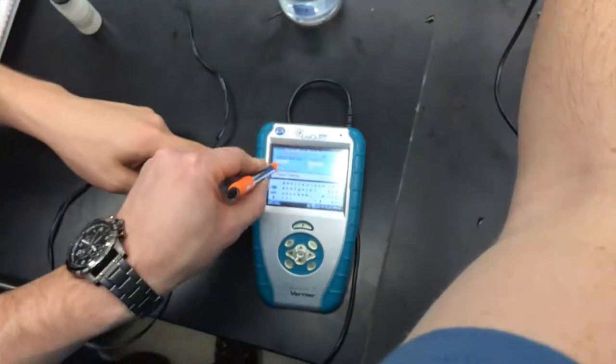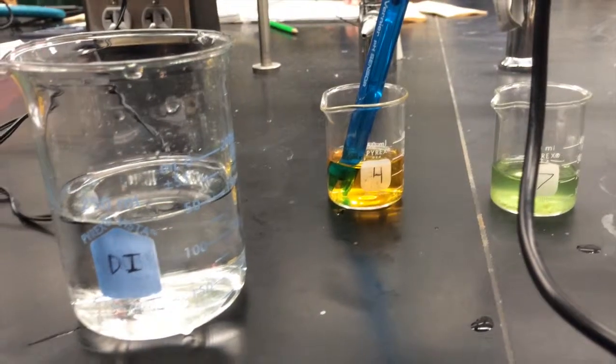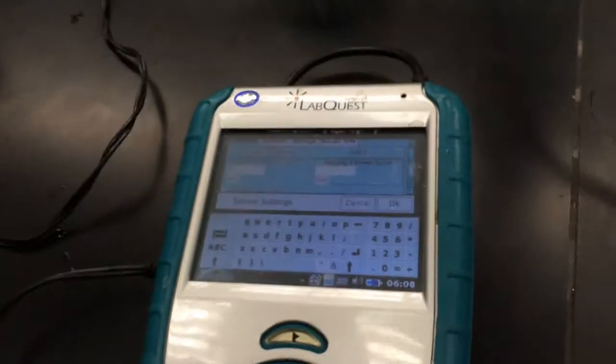Patton calibrates for the 7 pH buffer, and now he calibrates for the 4 pH buffer as well.